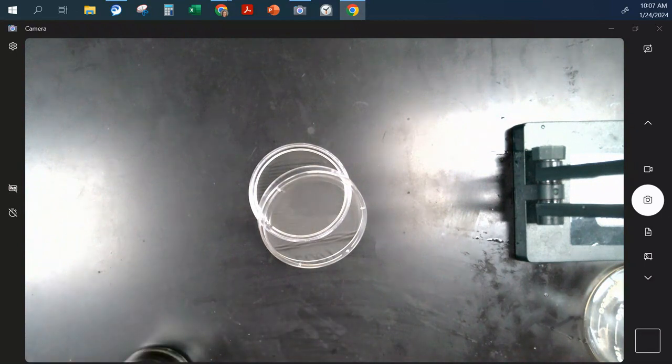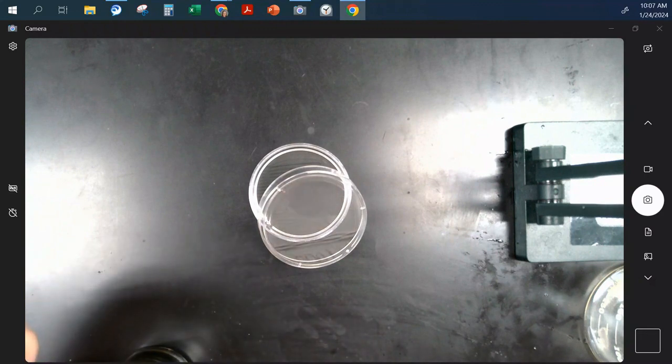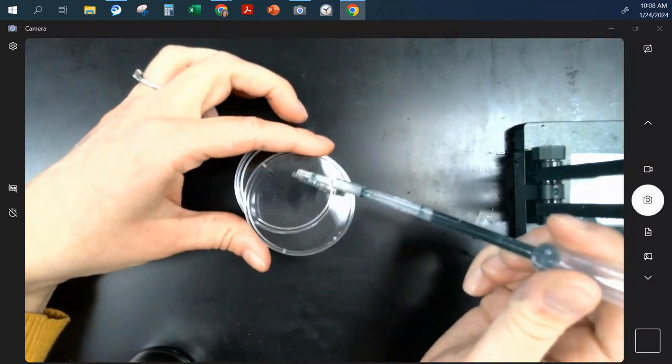This one doesn't have any particles. This one would be, I would say, probably impossible unless you can think of something else creative. I don't think you can test particle size with this one, because there's no particles. But you could test temperature, and you could test concentration. Remember, you're going to keep the same total drops, just change the amounts within the total drops. For concentration, yeah. So this one you could test concentration or temperature. Maybe decide what you're going to test first, because there's only two options.